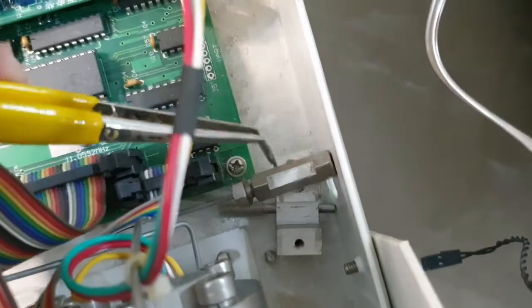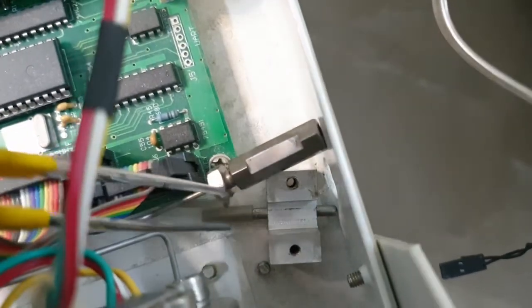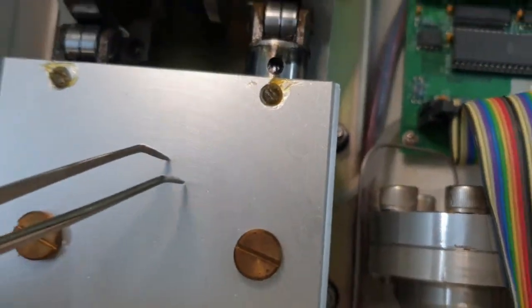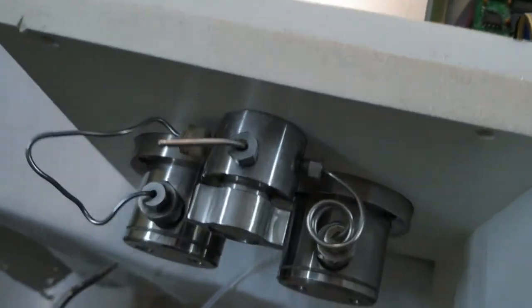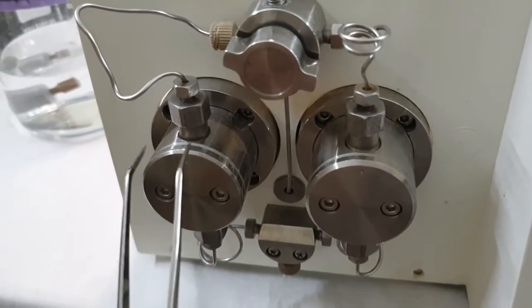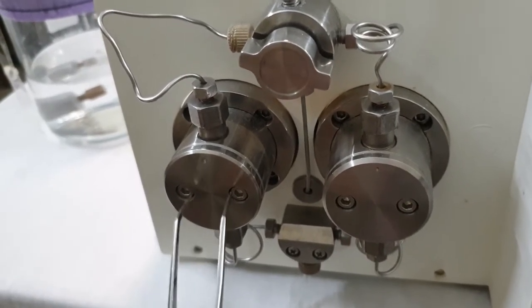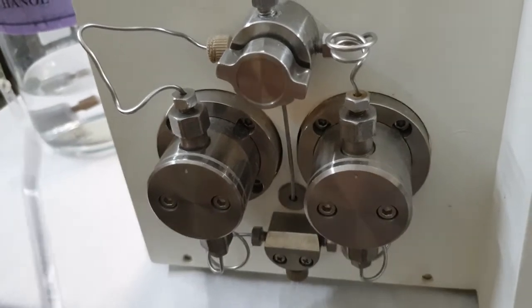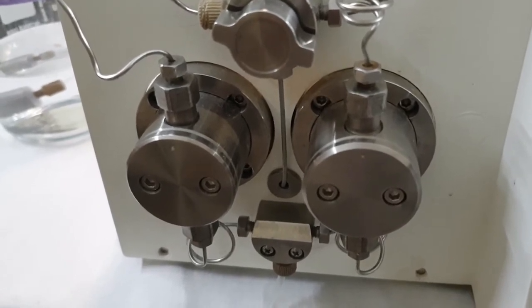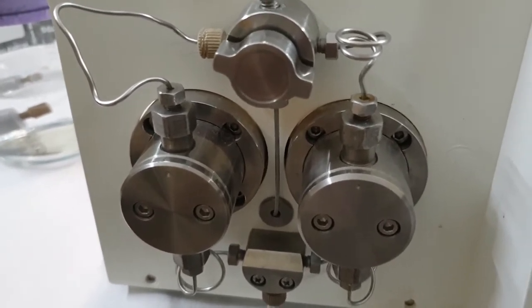We have unscrewed this part and it is now separated. This block is connected with a plastic tube on the back side, and this plastic tube comes from the stainless steel body, which is connected with the headset. This headset has two plungers and two plunger seals. The only reason for drainage and leakage is the deterioration of the plunger seals.